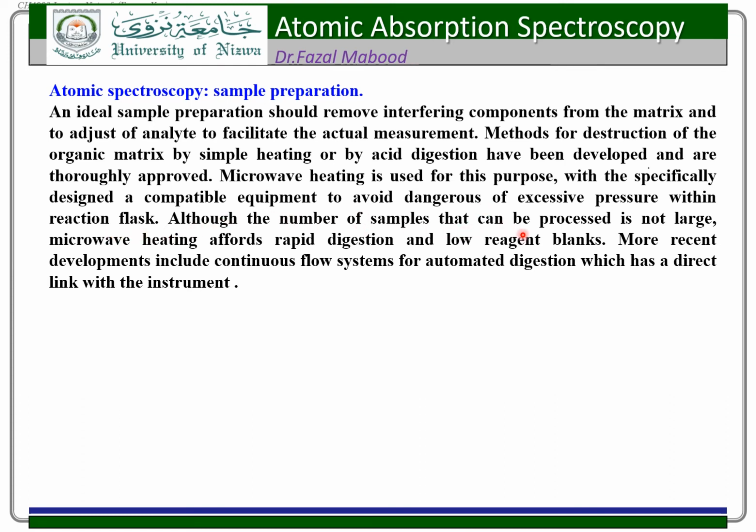Although the number of samples that can be processed is not large, microwave heating digestion affords rapid digestion and low reagent blanks. More recent developments include continuous flow systems for automated digestion, which have a direct link with the instrument.